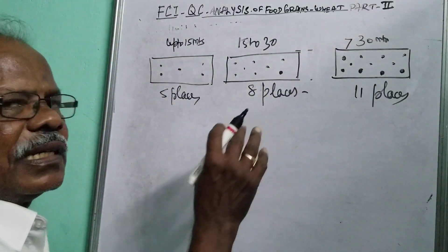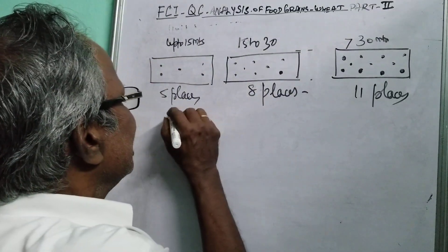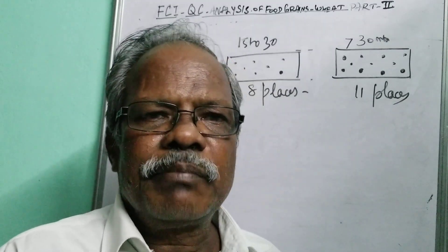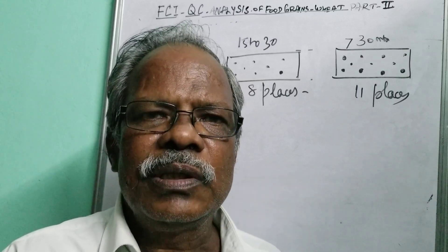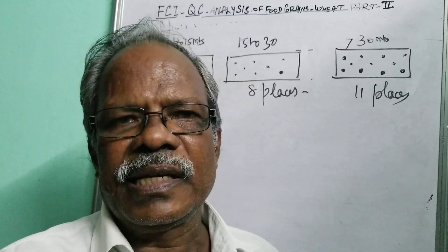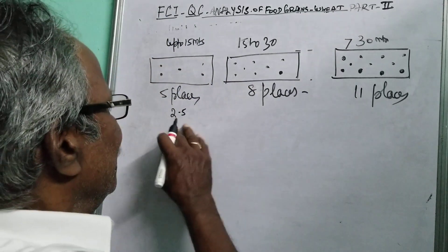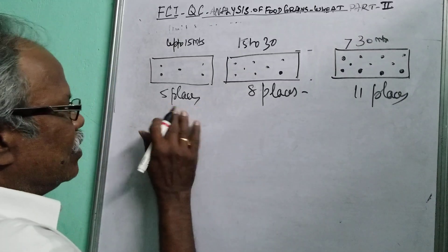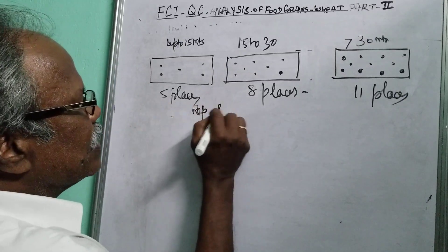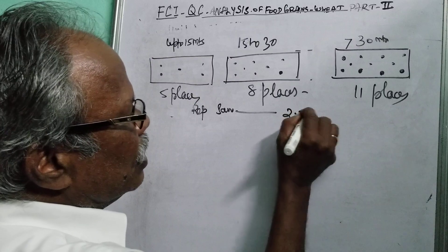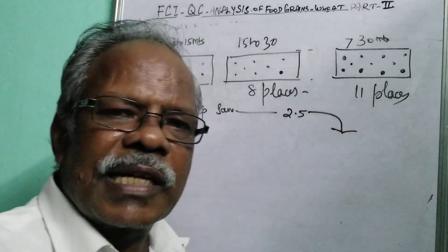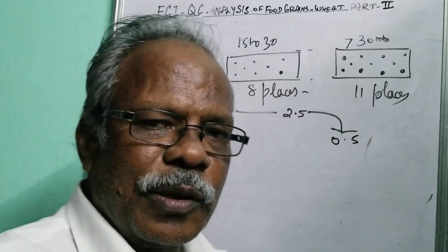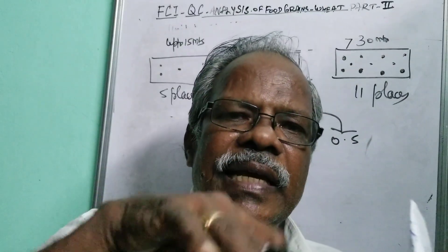At least 2.5 kg must be taken as the minimum representative sample. More than 2.5 kg can also be taken, but finally we have to reduce it to 0.5 kg. This reduction is done by putting the wheat into a sample divider.